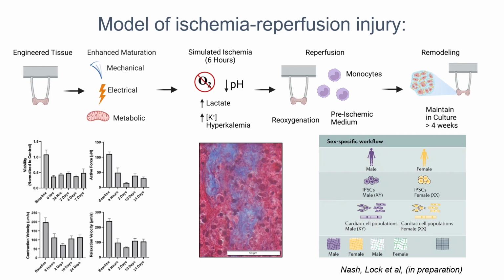What is very nice is this image that you see here, histology, shows you that we are also able to see this deposition of very large patches of collagen, which is this fibrotic process that happens in the heart following infarction.